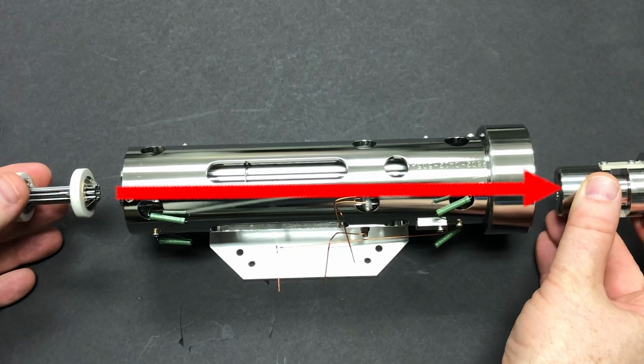And whether or not an ion makes it all the way through the tube and hits the detector and is detected depends on its behavior in the quadrupole field, or one thing that we say is its stability. If it's stable in the quadrupole field, then it survives and passes all the way through the tube and hits the detector and is detected. If it is unstable in the quadrupole field, then it flies out of the mass analyzer and is not detected.